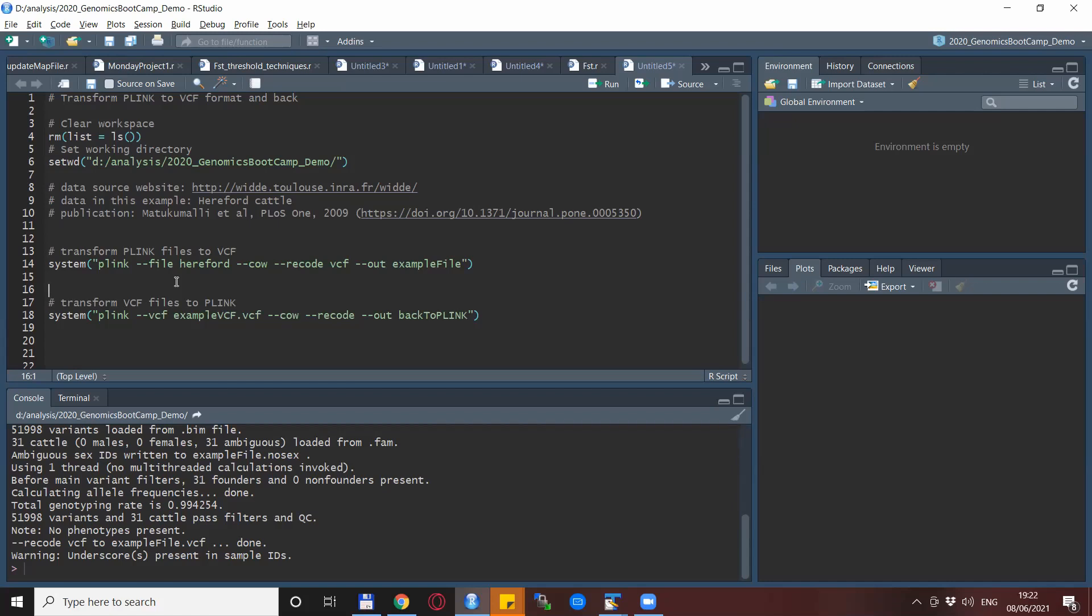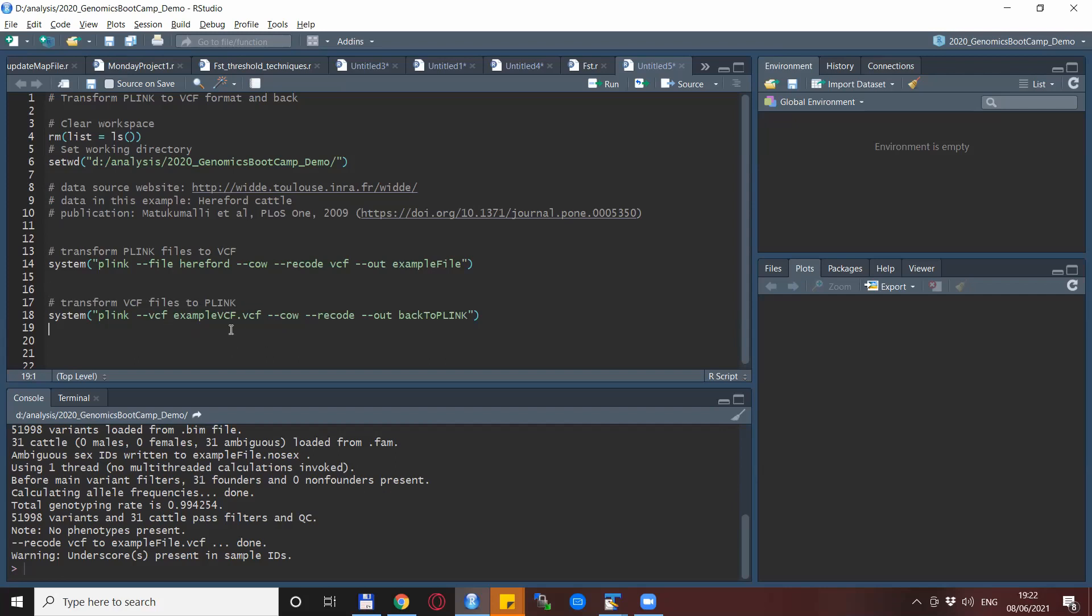But first things first, the overall structure of changing VCF files to Plink files is very similar to the previous one. Basically you use the dash-dash VCF Plink option and then you specify the file name. Here I would underline that the VCF file requires the full file name and here I just change to the one that I changed already.